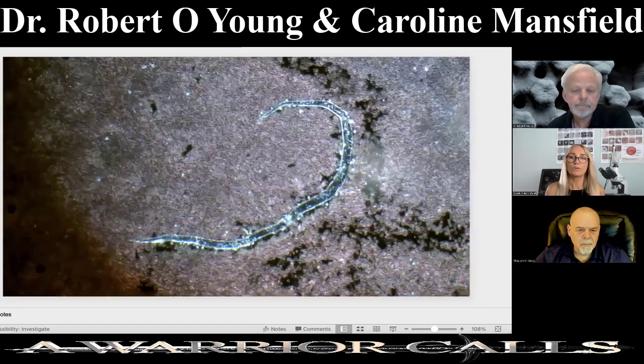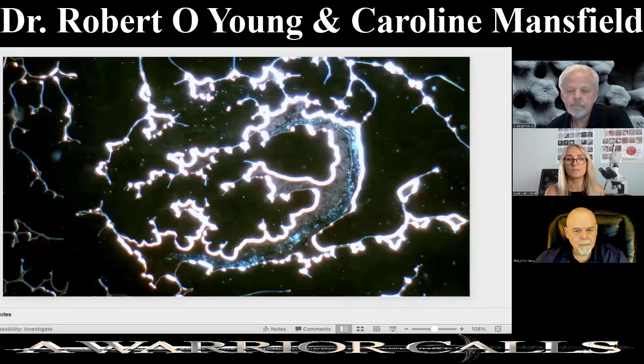The other thing I wanted to show you, Christopher, is these structures that a lot of people are showing in the blood and how they're affecting the blood and the blood working correctly for us. When we dry the blood out, for example, I'm not talking about dried blood analysis, this is the same slide left for 24 hours. The sample's dried out, and you can see that this sort of hydrogel potentially inside the blood, I don't know, I'm just assuming, you can see how it's all dried and it's created certain patterns.